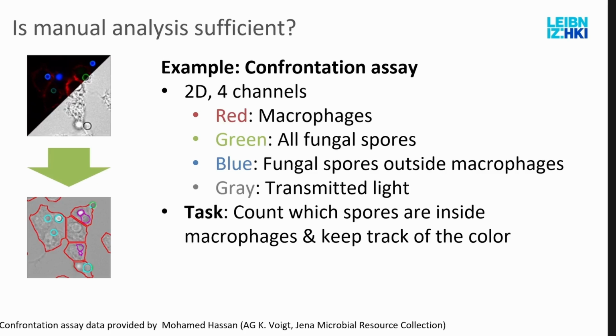So let's start with when you get the images out of the microscope. Then, I also did it myself, although I'm a bioinformatician, you often analyze them manually. You can just look at them and count manually, for example bacterial colonies, using a pen to count the colonies and so on. But you quickly hit a limit with this.